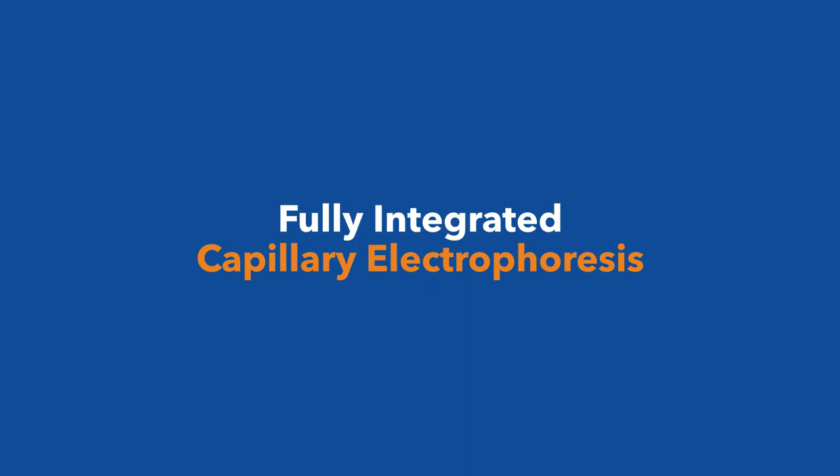Meet Maurice, the solution to your protein analysis needs. He's a fully integrated capillary electrophoresis platform that can support multiple CE applications.